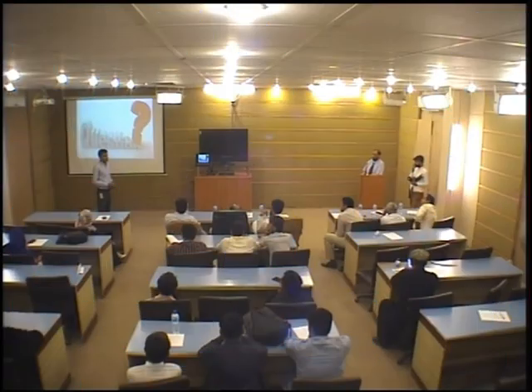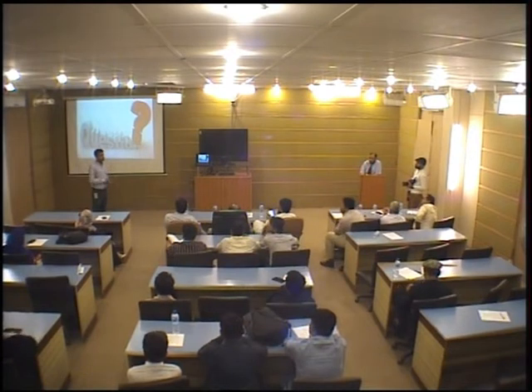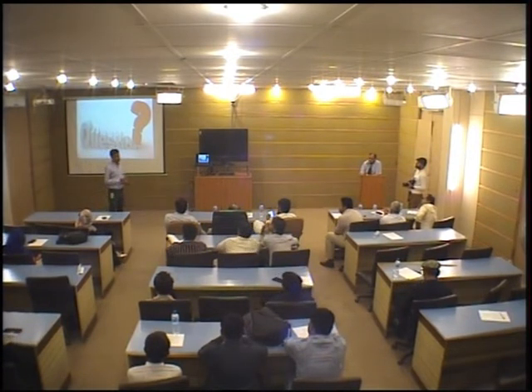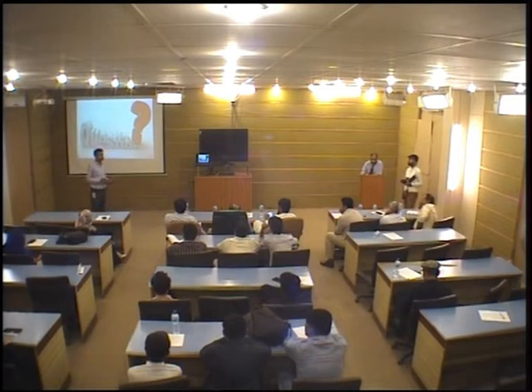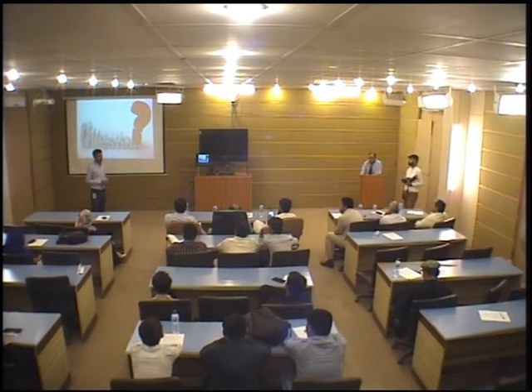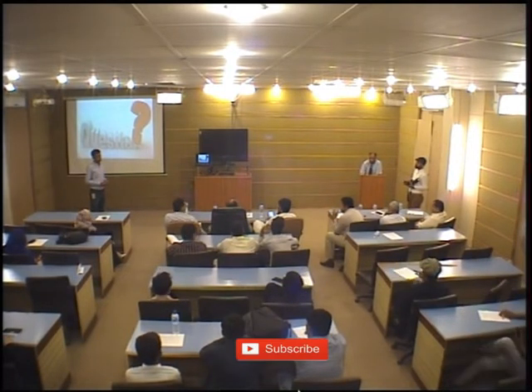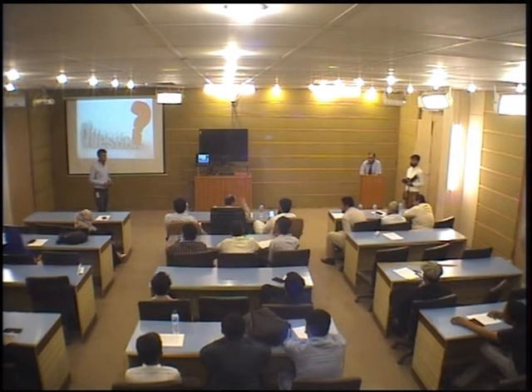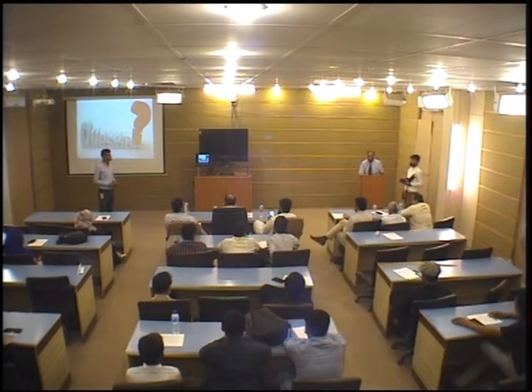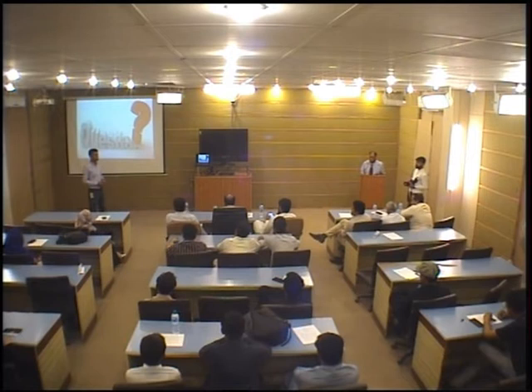सर, अगर कोहल की बात रिलेटेड है तो हाशमी सुरमा की जो उसकी अपनी वेबसाइट है, उसके अंदर आप जाएंगे तो वहाँ पे लाइसेंसेस पड़े हुए हैं हाशमी सुरमा के, लेकिन उसमें मेंशन्ड है कि कोहल में कुछ भी नहीं है, लेड उसमें कुछ भी नहीं है। लेकिन हमने डिफरेंट टेक्निक से फाइंड किया कि जो कोहल है उसमें लेड मैक्सिमम कंसंट्रेशन में होता है। सिर्फ मैंने ही नहीं, डिफरेंट जो इंटरनेशनल जर्नल्स हैं उनमें भी अगर वो कोहल को एनालिसिस करते हैं तो उनके पास भी लेड मैक्सिमम कंसंट्रेशन मिलता है। Actually these are local made companies, तो उनके अंदर ये चीज़ें काफ़ी सारी प्रॉब्लम हैं। उसका लाइसेंस मैं आपको दिखा दूंगा सर। ओके, एनी अदर क्वेश्चंस?